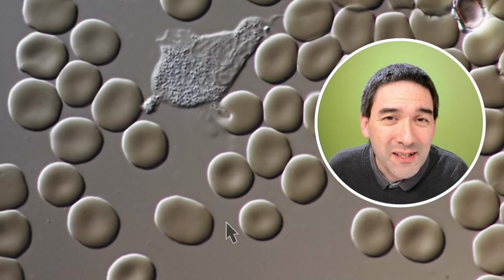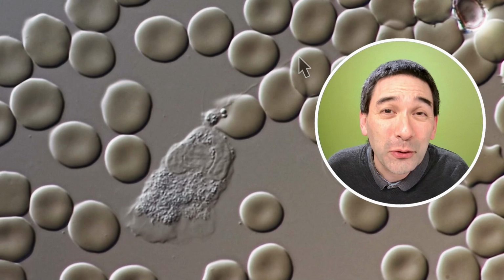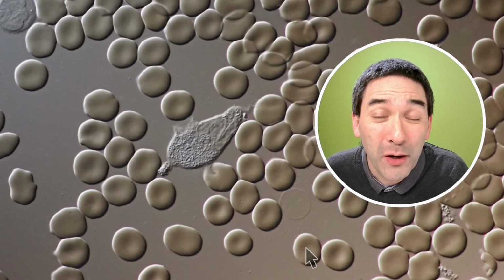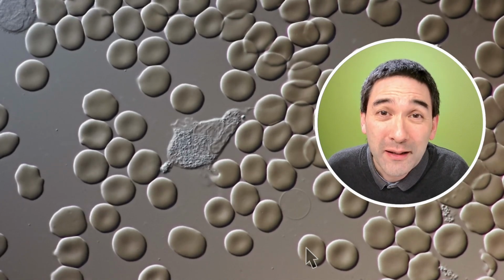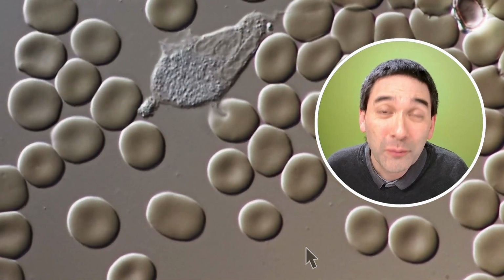All of those other disc-shaped cells that you see here are, of course, red blood cells. They're not able to move on their own, but those white blood cells like to crawl around inside of our body and protect us from disease, because what they do is they try to hunt down and catch bacteria that might have entered our body, and therefore they're protecting us from infections.